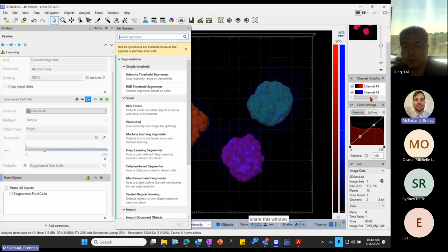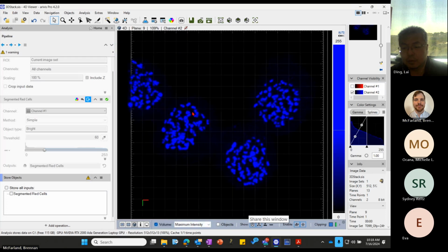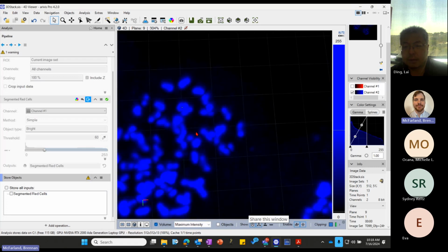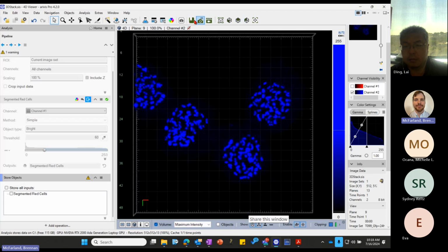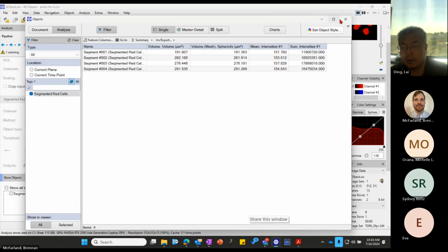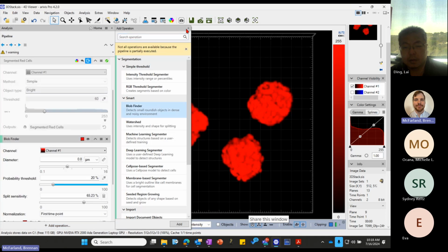So we'll definitely want to use that blob finder to get these blue objects out because they look pretty blobbish, right? They're small. They have some sort of spherical structure to them. Maybe not perfect, but close enough. But I'm wondering if we can also use that to get these larger objects because they also look like large blobs. So we'll just try it out.